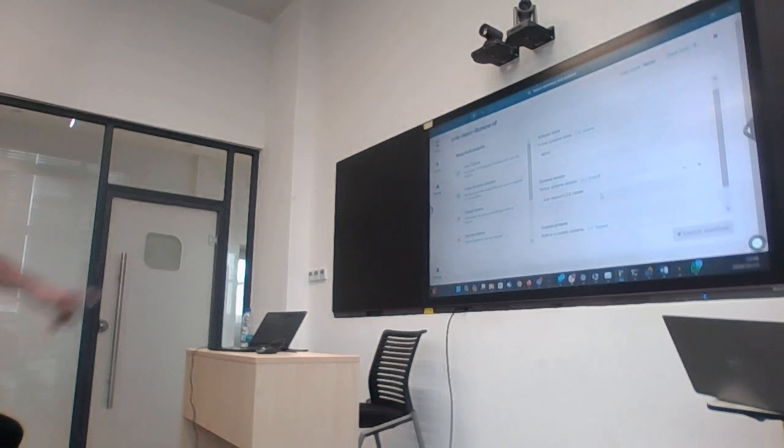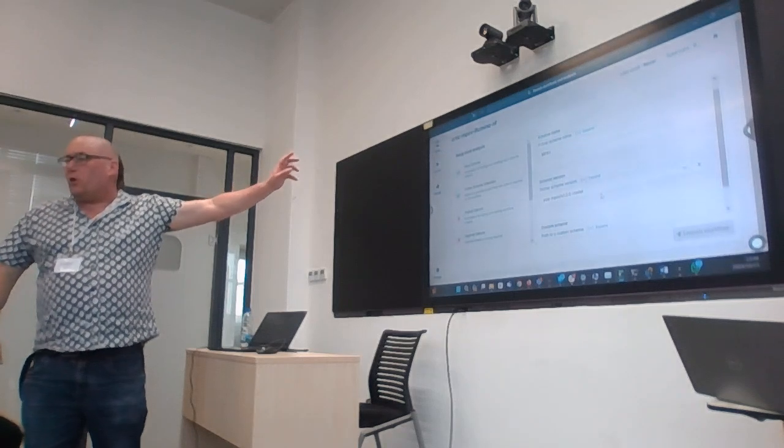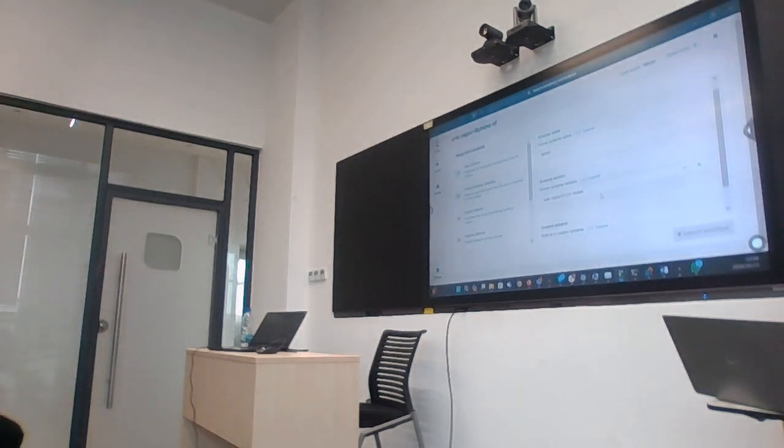The default here, I'm actually going to talk to the author of this thing because I don't think there should be a default. I think that it should be red until you actually choose something, because you don't want to accidentally choose the wrong scheme, okay? So now, what are we dealing with? What did I say? This is a clade 2 sample, okay? There aren't yet primers. There will be primers in the future, but there aren't yet primers for both clades. That is, there are not yet systems designed for working on both, okay? Because they're too different to each other, okay?